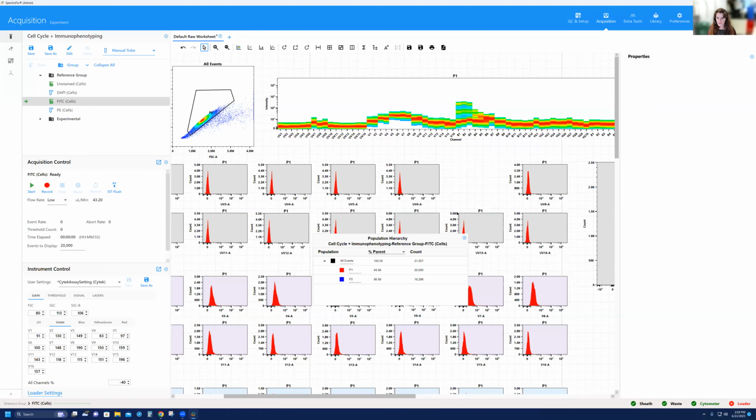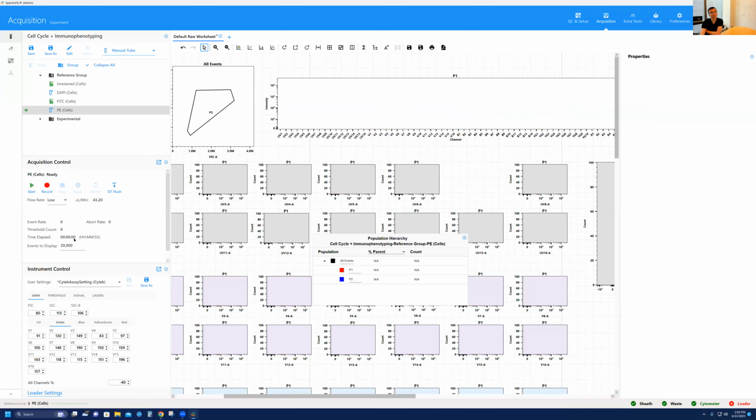Okay. And then I'm going to run PE next. I'm thinking based on how timing is going, it might be a little bit rough for us to do analysis today because I talk so much, but I think everyone's used to that. Let's throw on the PE. I was wondering how I'm going to do analysis in 10, 15 minutes. But yeah, I think we'll have enough to go over today in this session.